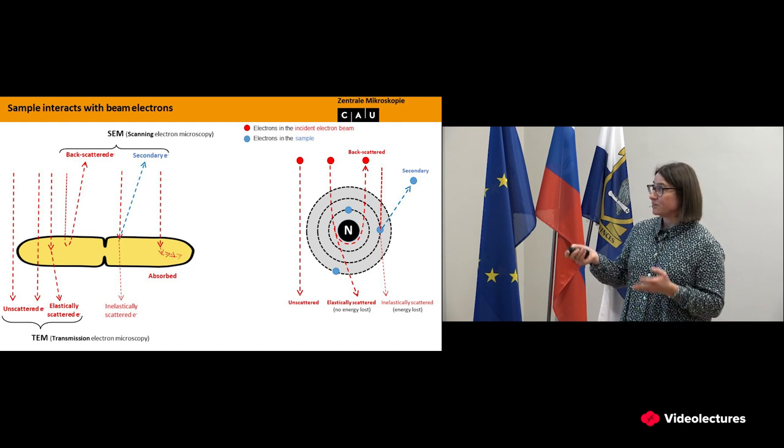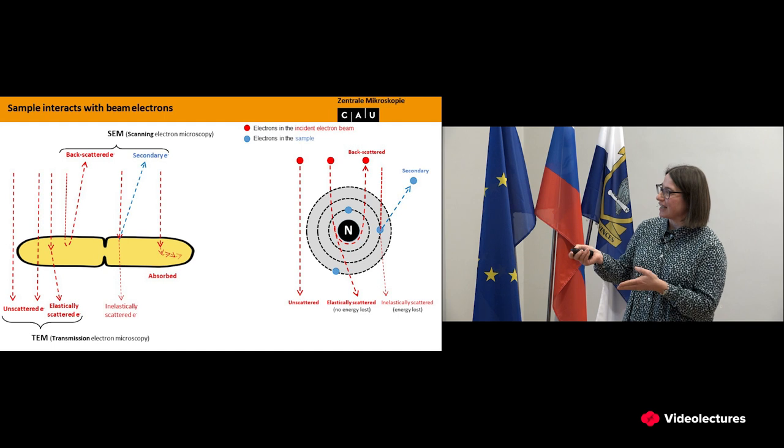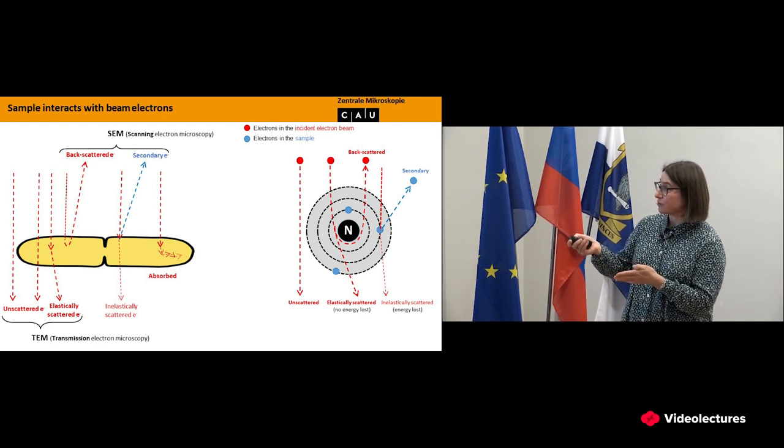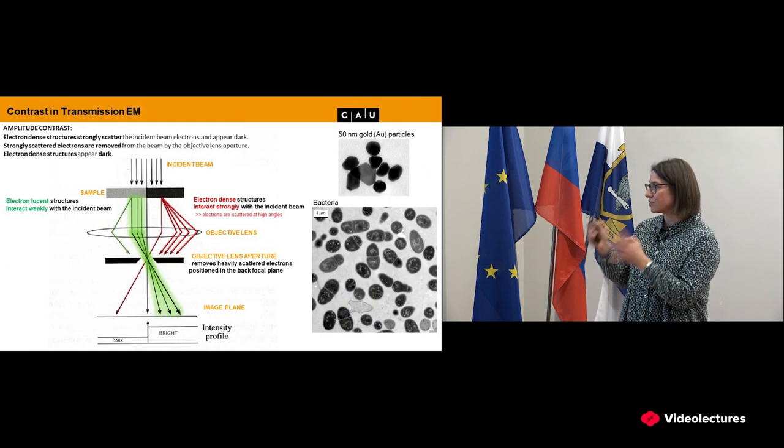In transmission electron microscopes, the electrons have to go through the sample, and when they interact, some will be scattered. And so in the microscope, as we will see later, they will be mostly eliminated from the image. Whereas in scanning electron microscope, the electrons that come in the beam produce secondary electrons, so they eject electrons from the metal coating, and that will make mostly the picture. It can also be the backscattered electrons. So in transmission electron microscopes, the image is formed by the electrons that go through the sample, and in scanning, it is coming from the surface. So this is just about how the contrast is made.